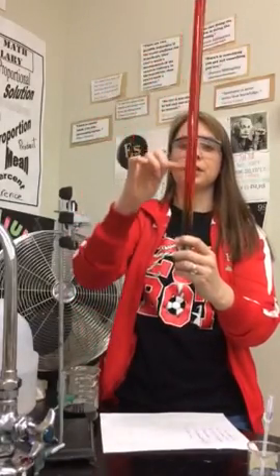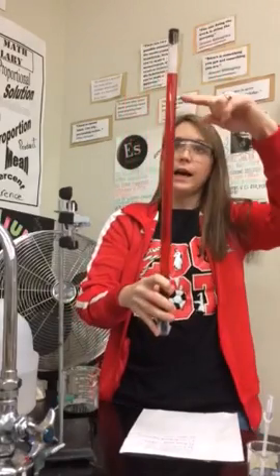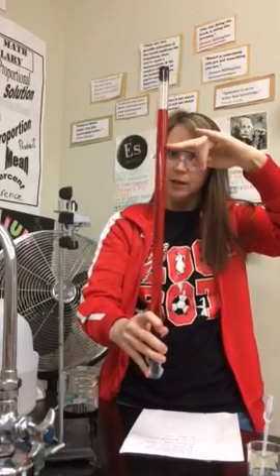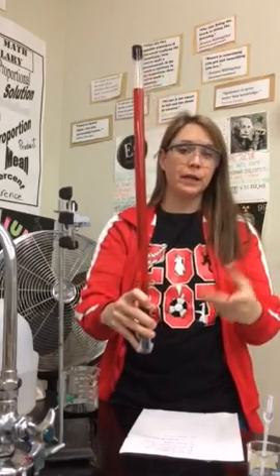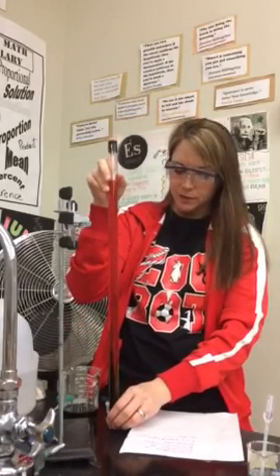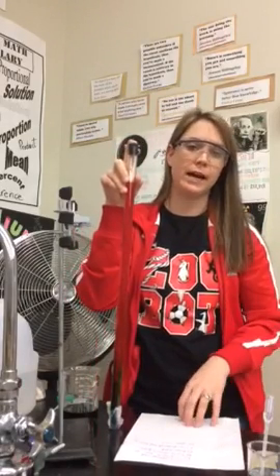There's a high concentration of acid. That's the answer to question 1. A high concentration of hydrogen ions because it's red, and acid indicates that there's a high amount of H+. Where it was green, there's an equal amount of hydrogen and hydroxide ions because it's neutral. When you saw the bluish purple color, that was a base being added, which means there's a high amount of hydroxide ions present.